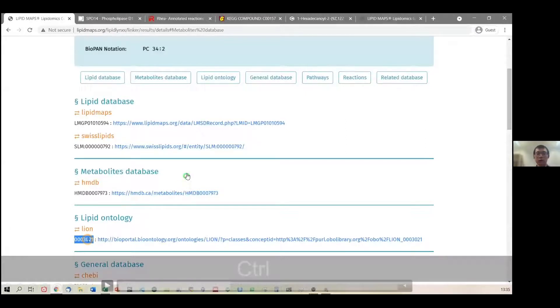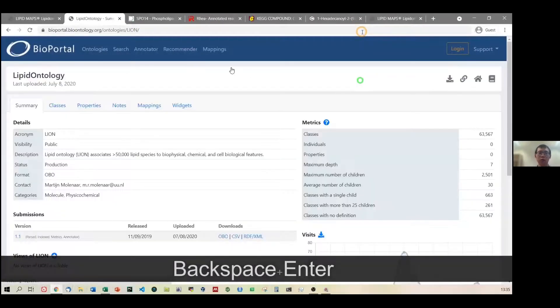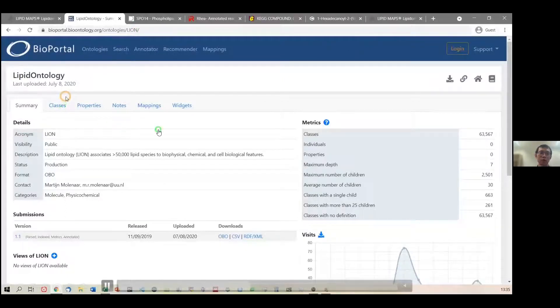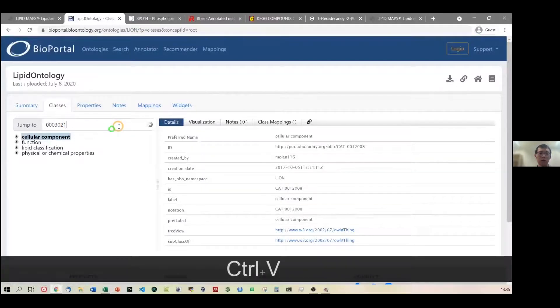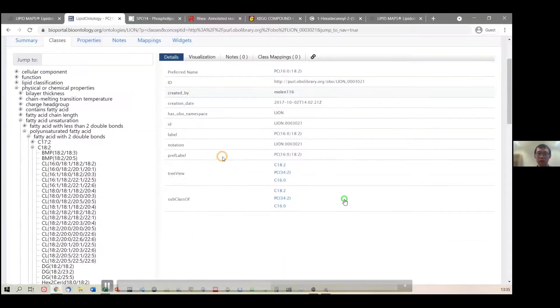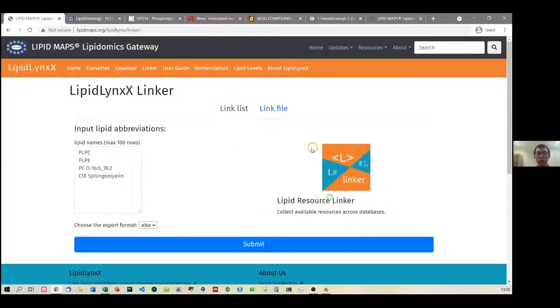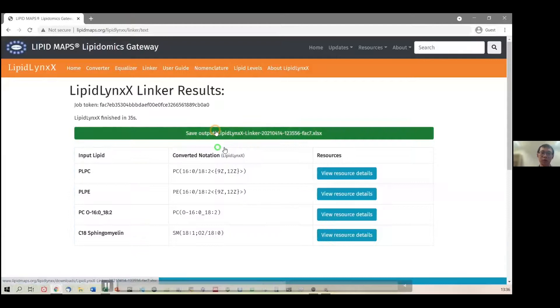Sometimes the database will update and some links may not work. That's why we also have the identifier number. For example, for LION we recently found some link issues, but no problem — you can copy the identifier, go to the LION ontology page, delete the broken part of the URL, navigate to the classes, paste the identifier, and find the entry. It will show you the full ontology information from the LION ontology.